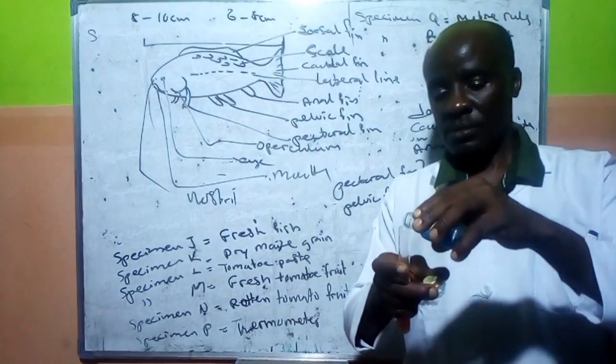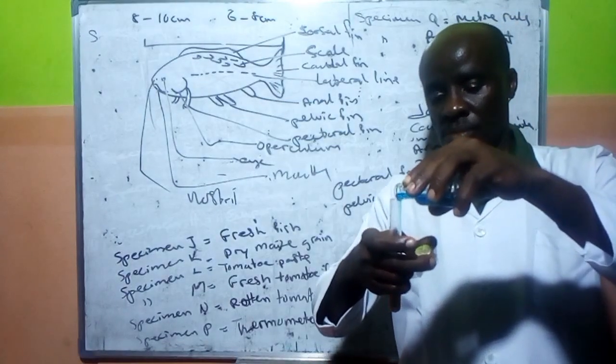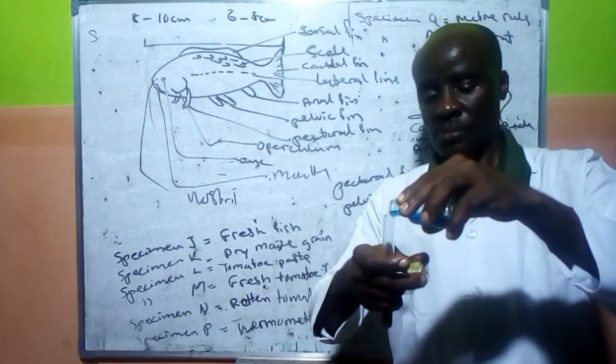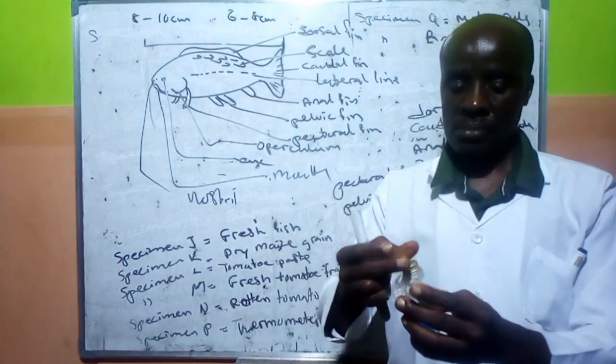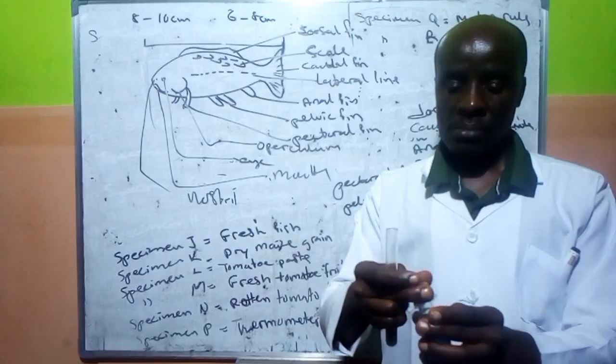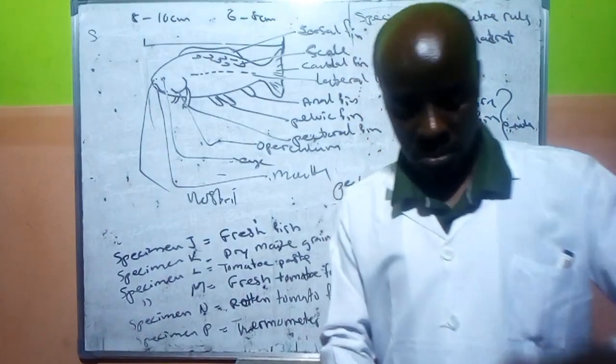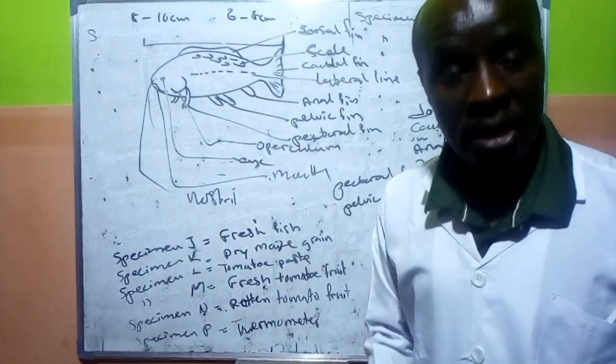So I add Benedict's solution. Then it needs heating.